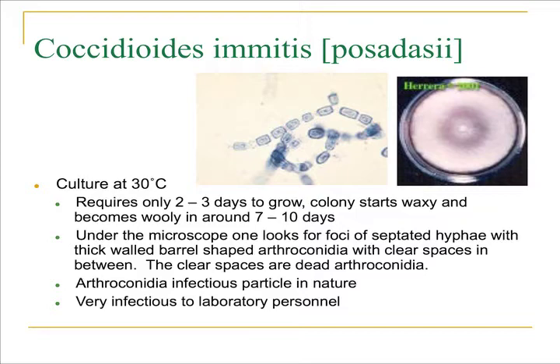Because this organism can grow so rapidly, it can appear on regular microbiologic plates in your bacteriology laboratory. So you have to be very cautious in your bacteriology lab if you do see a mold colony to take it into the mycology area underneath the hood for observation.